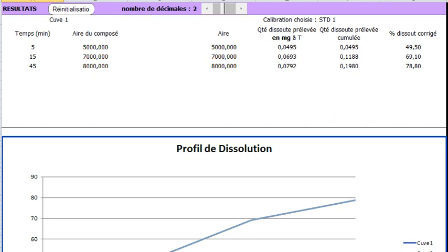For example, the average of the first and the third at the middle of the sequence, if you consider that this one has the best recovery compared to the areas. As you see, it offers large possibilities. The corrected reasons are automatically calculated, as well as the quantity in the aliquot withdrawn at each term.